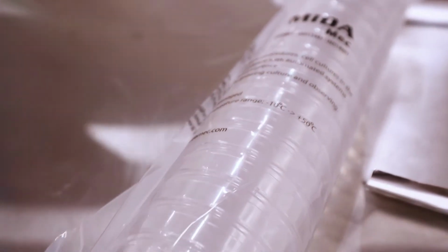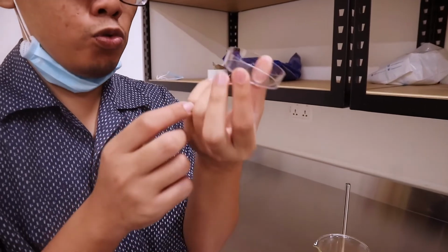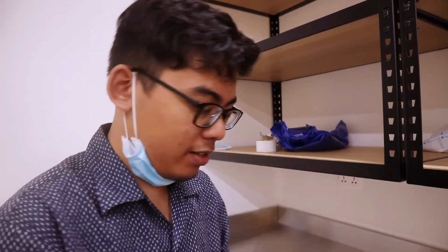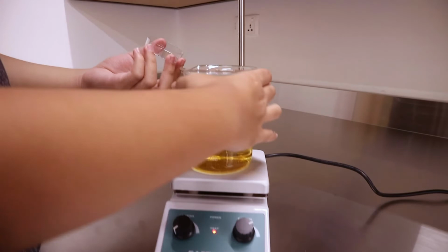See? Let's do a marathon pouring session. We will want to fill this to half of the dish height. Okay. Really hard and make sure you don't burn yourself.